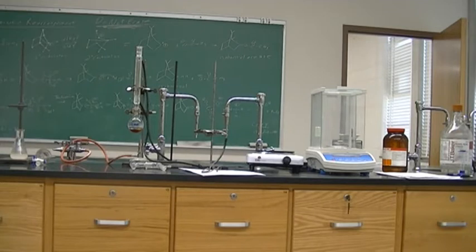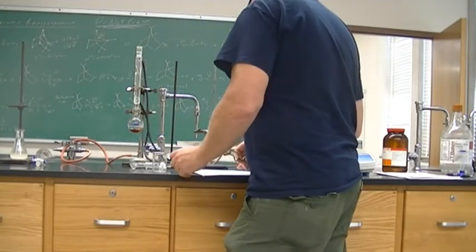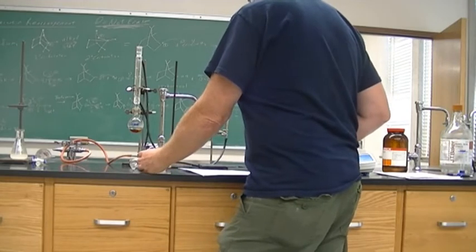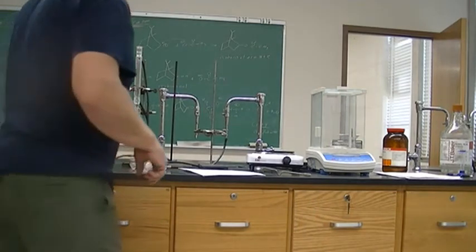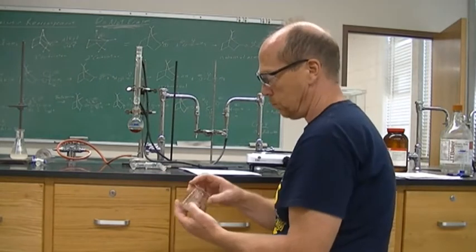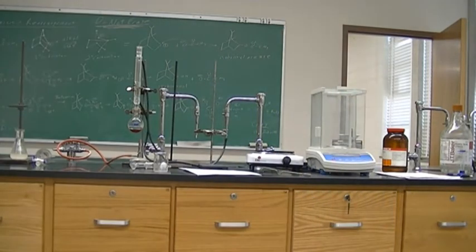All right, so we're going to take it slowly onto 5 grams of ice, and distill for 7 minutes. Okay. Turn off the distillation. Let that cool for a second, and then we're going to pour it onto our ice, which is then going to solidify, and then we're going to collect it on our vacuum filtration.